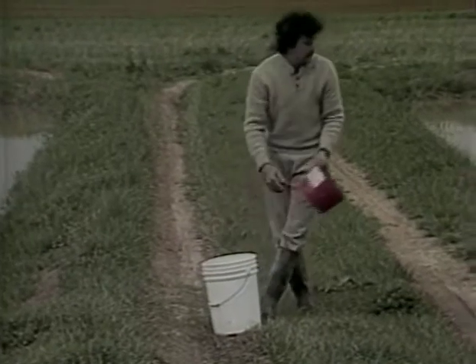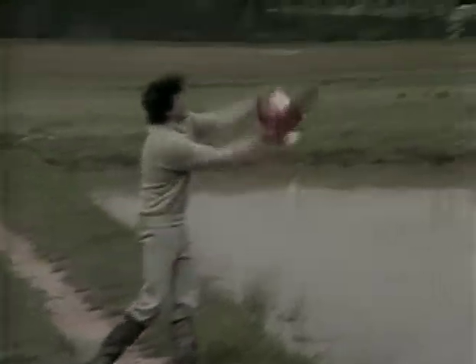It should be mentioned that total alkalinity is composed of three types of alkalinity: hydroxide, carbonate, and bicarbonate alkalinity. Relationships between these types of alkalinity are normally included in test kits, and many prove confusing. However, what fish farmers are interested in is total alkalinity, which may be measured as described.